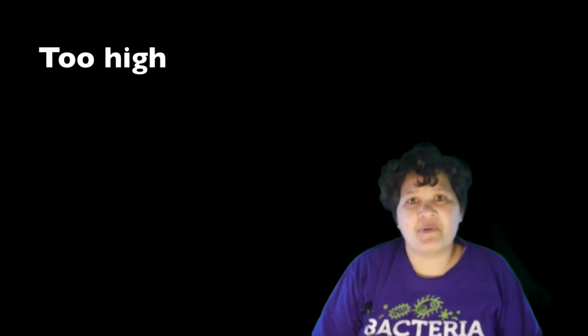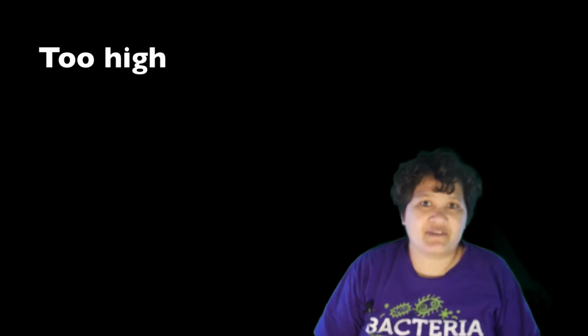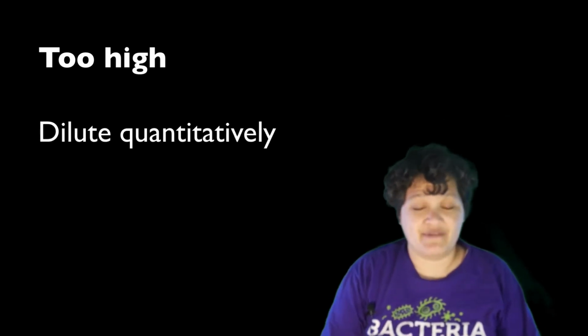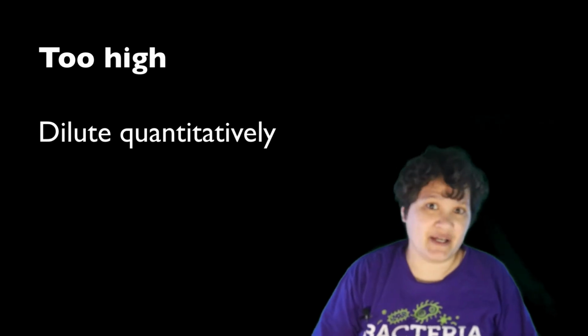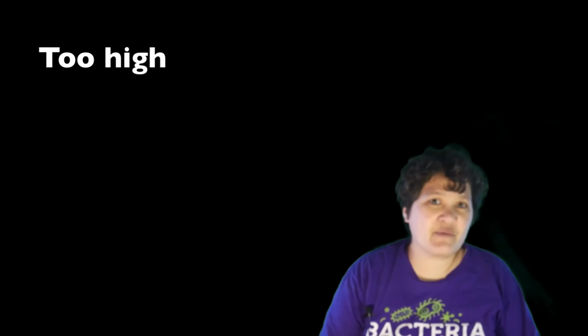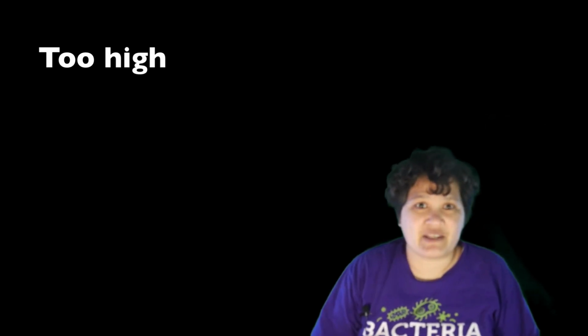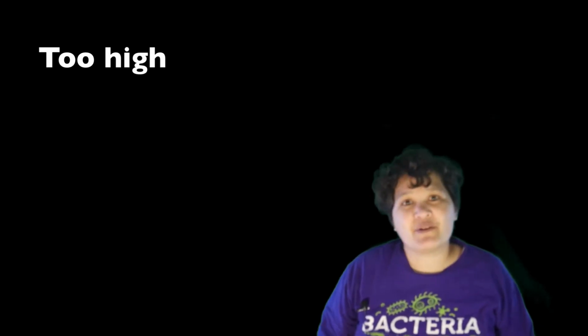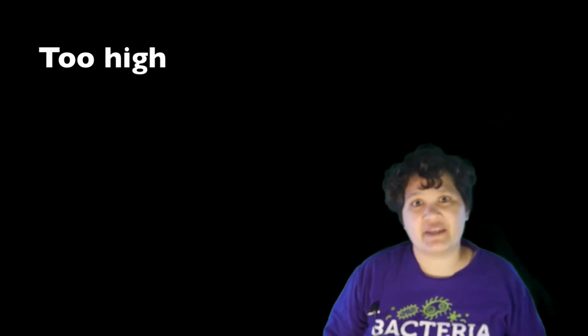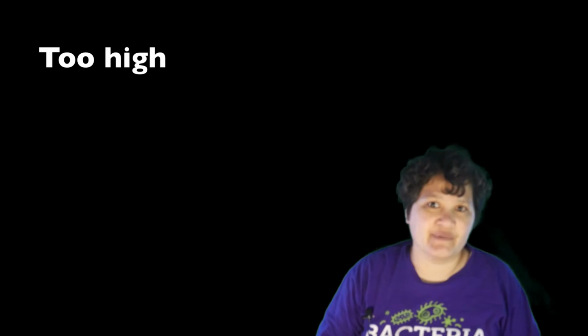So if your reading's above the dynamic range, a lot of times you're just going to dilute your sample in a very precise and quantitative fashion, i.e. pipettes and volumetric flasks. You don't always know how much you need to dilute your sample, so this may be an iterative process. Remember, the way you're probably going to find out that your concentration is too high is actually to run a sample and find that the concentration you get is over the limit of linearity.